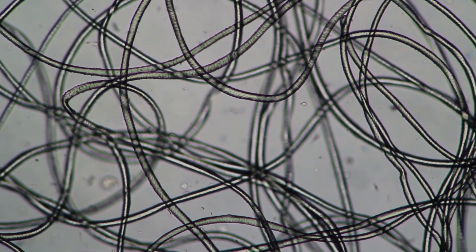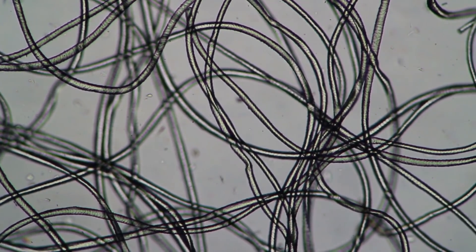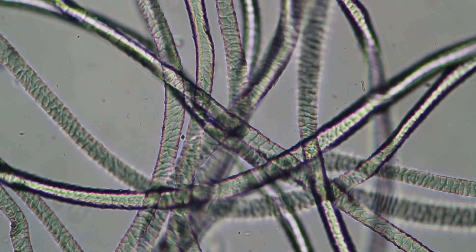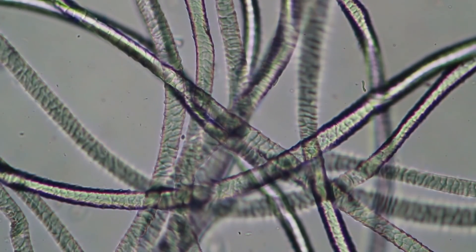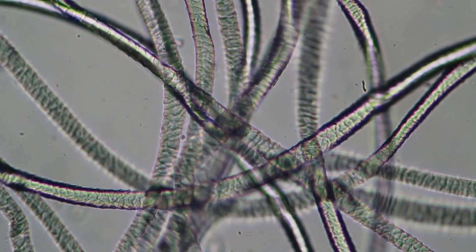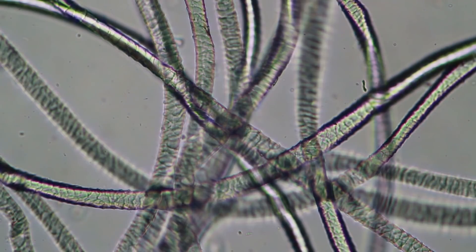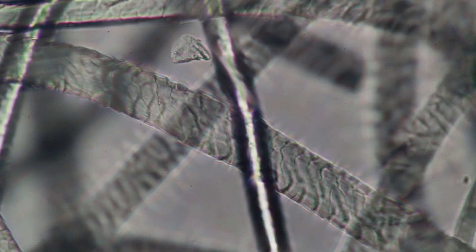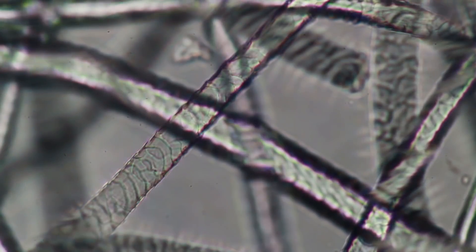Everything goes under the microscope, and here we are in bright field. That is wool at four times magnification. This shows you that there is already a surface texture here. Using the ten times objective, you can see that the wool — the fur — is not completely smooth, but there are small scales on the fur surface. This is actually a sign that we're talking about a natural product, because many synthetic fibers are completely smooth. At higher magnification we can see this quite nicely. I think it could be those scales that cause the wool to stick together a little bit.